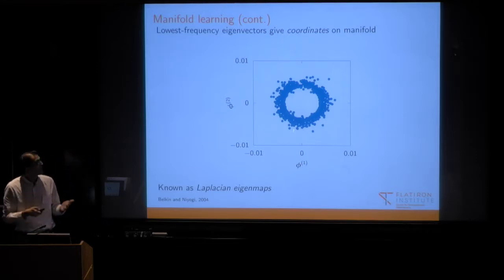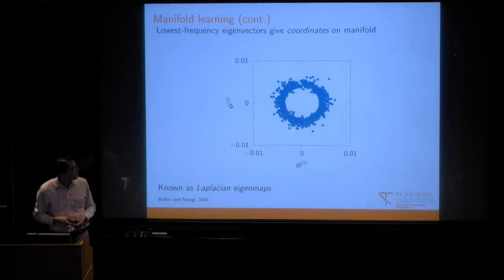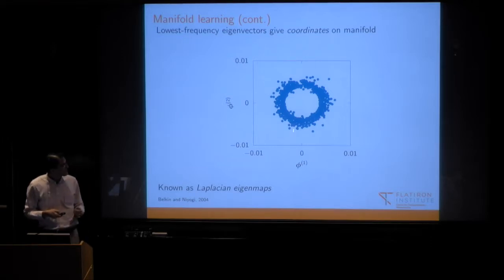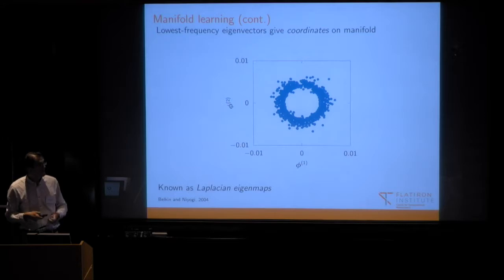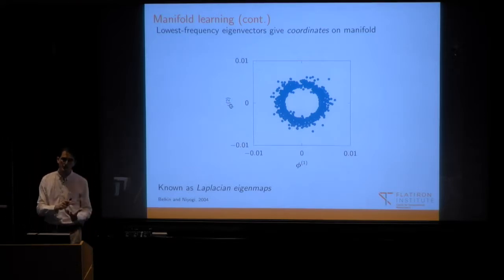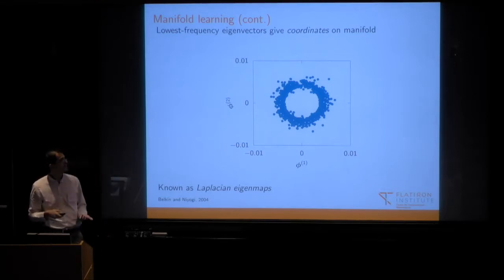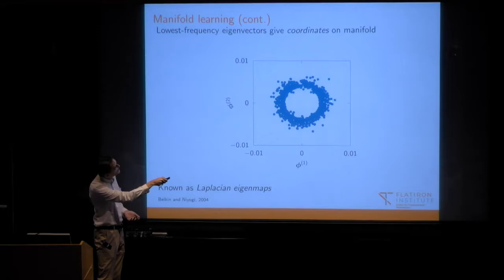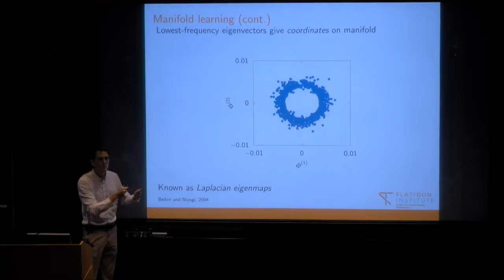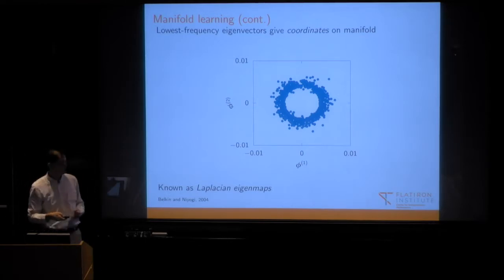But what can we do with this? Well, for one, we could look at something like an energy landscape, like what Joakim was talking about yesterday. Another thing we can do is get out of these low-resolution reconstructions that we have. Because now that we have an idea of what the manifold looks like, we can say, well, these images are similar, so maybe we can reconstruct them together. Maybe we can take this node here and take all the other images that correspond to some similar reconstruction and apply regular full resolution reconstruction to these things.